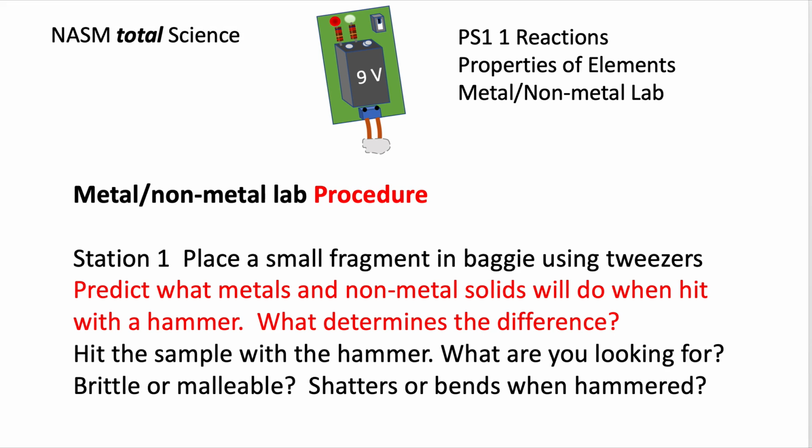So you're going to hit the sample with the hammer. That's against a hard object. We used the bases of clamp stands to do that, and determine whether they're brittle or malleable. Do they bend? Do they shatter? Bending and hammering, denting is malleable.